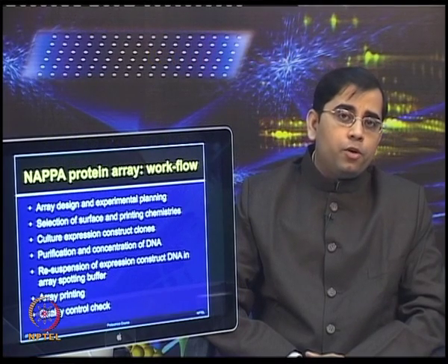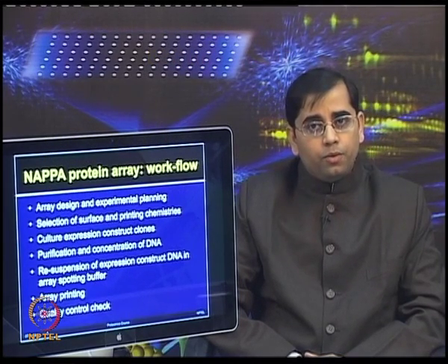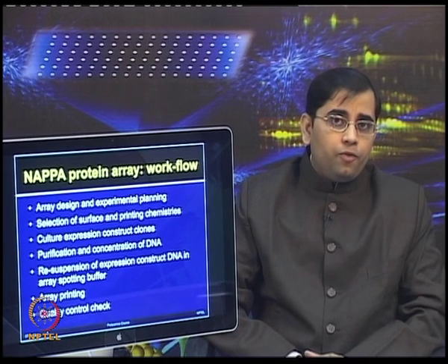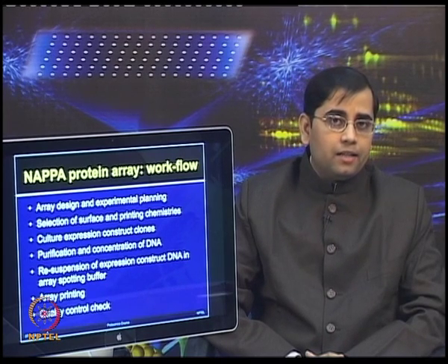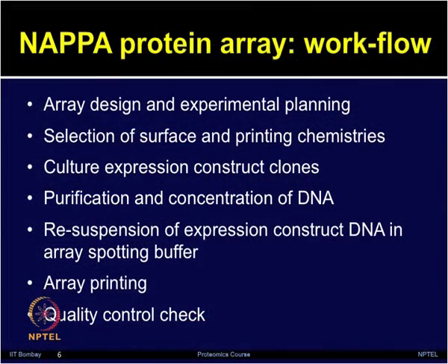So, in general, when we talk about NAPPA protein arrays in the workflow, we will talk first of all about the array design and the experimental planning required for performing these arrays. Unlike other proteomic techniques, where one starts with unknowns and only after a lot of experiments can identify the proteins by using mass spectrometry, in protein microarrays people are already aware of what type of contents are printed on the chip surface to start with, and those contents have to be very well planned.